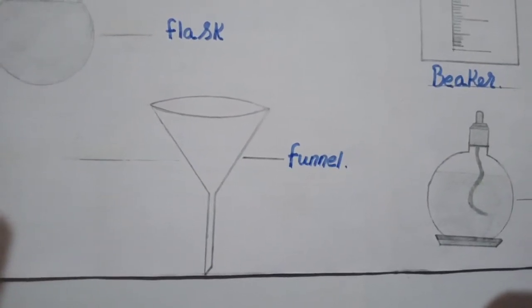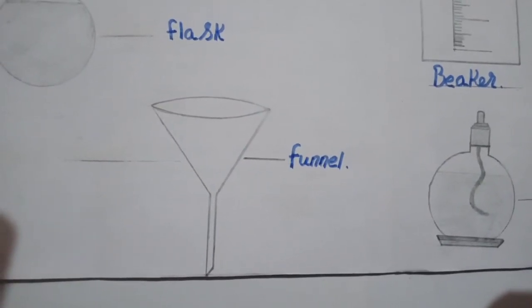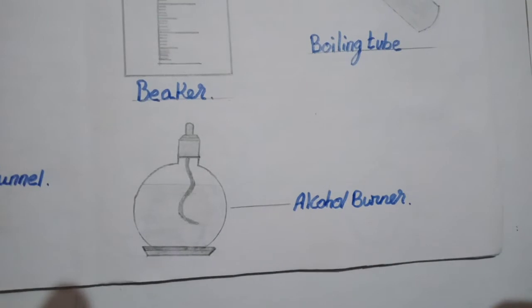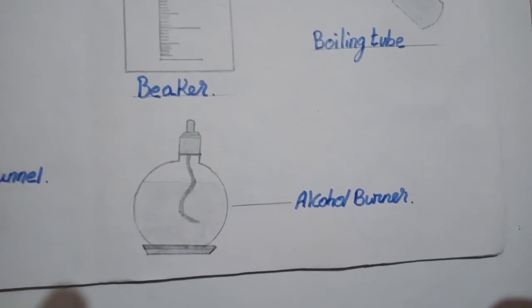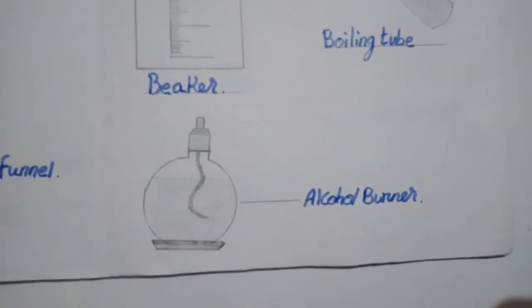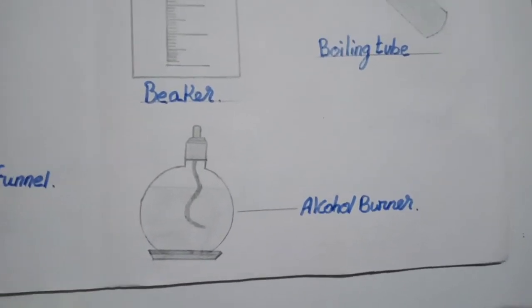Next one is a funnel. The funnel is used to put some chemicals into the test tube and to filtrate. Next, this is a burner — this is an alcohol burner.